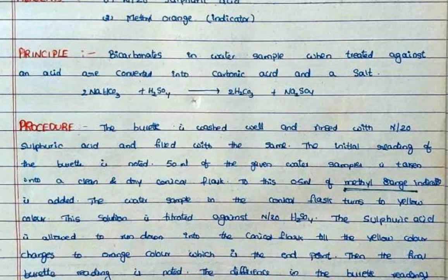The sulfuric acid is allowed to run down into the conical flask.